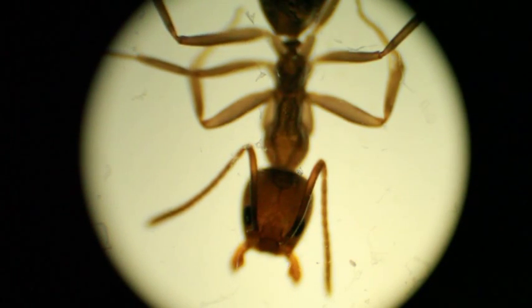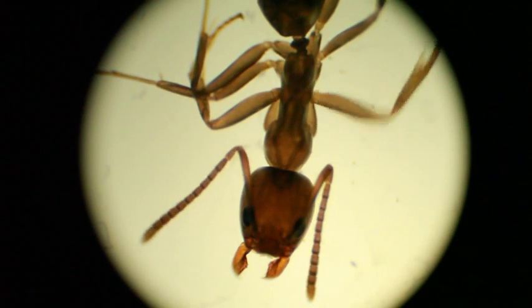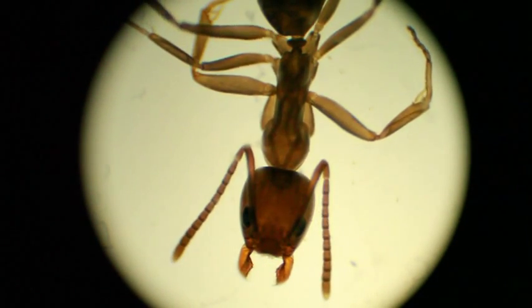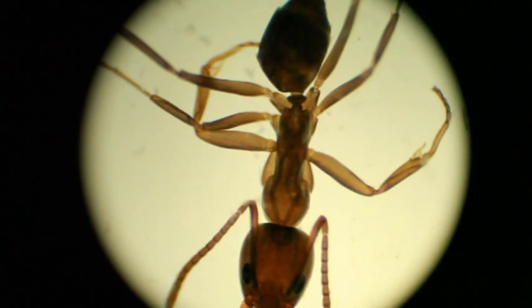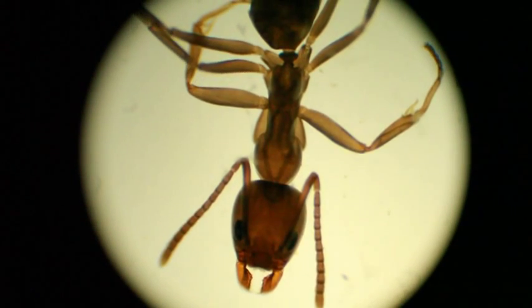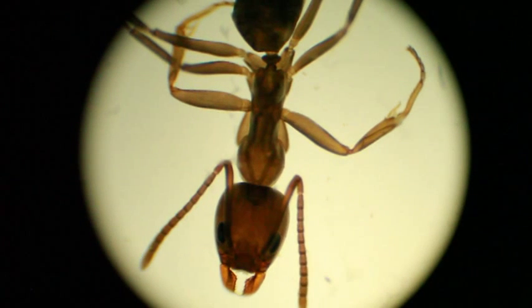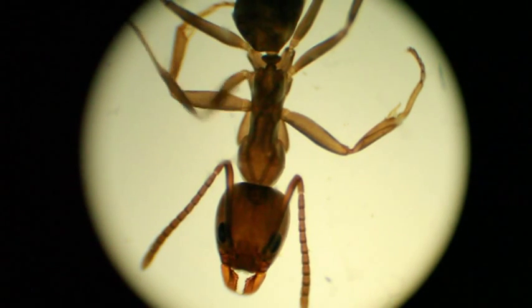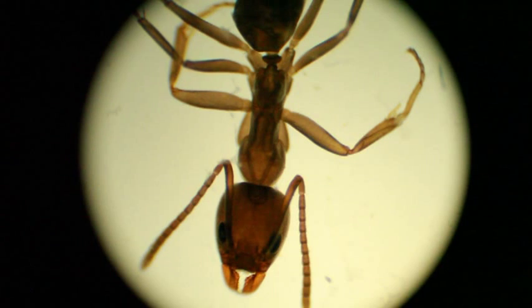Oh no, somebody help me. I'm trapped. Wait till I get out of here, you big bully. I'll kick you with my six legs — if that's the proper way to say legs for ants, who knows? It's exciting though. Alright, this is pretty fun, but let's see what else I can find and look through the microscope.